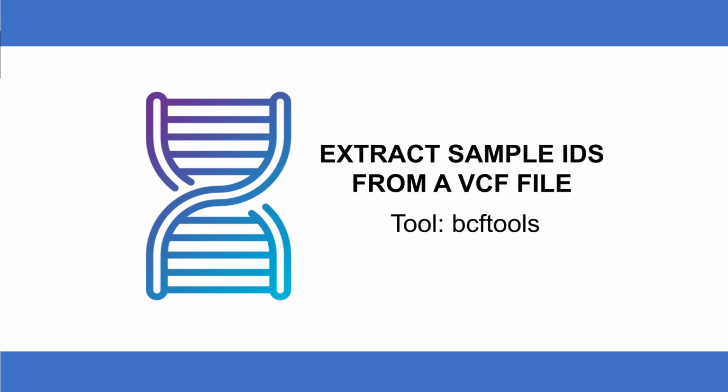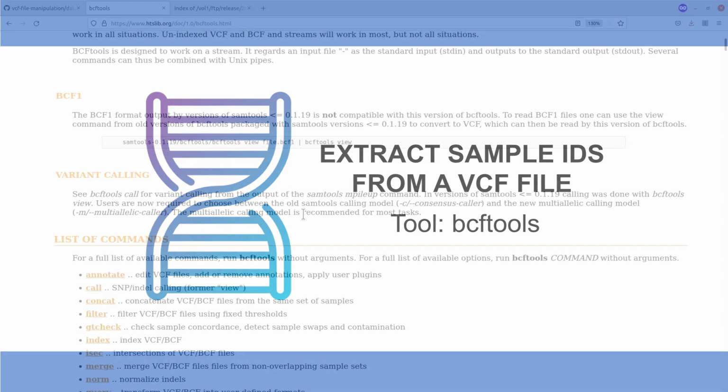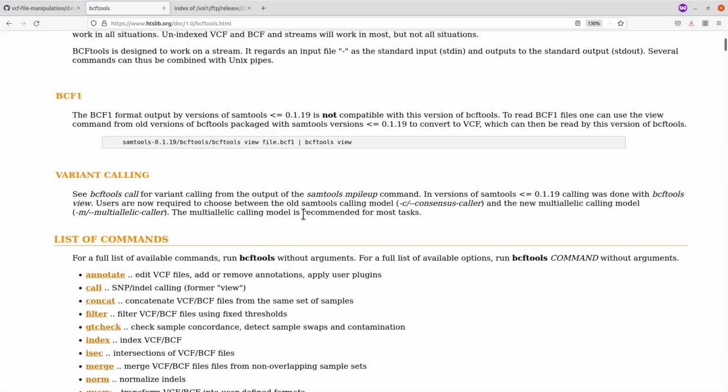Today's video, I am going to show you how you can extract sample IDs or names from a VCF file. And the tool we are going to use is bcftools. So bcftools has a set of utilities that can help you to manipulate VCF files.